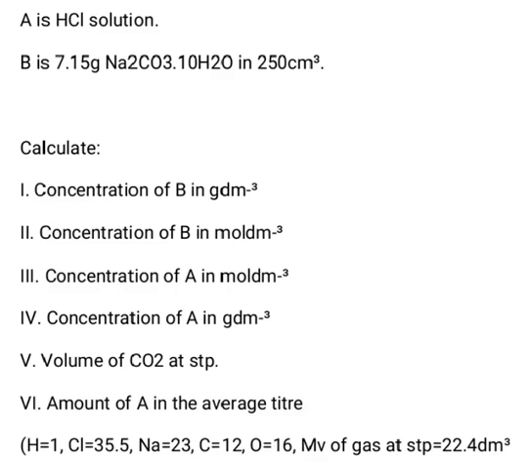Okay, you can see from my previous videos that we've done something similar to this along this line. Titration between hydrochloric acid and sodium trioxocarbonate(IV) decahydrate. I told you there are different modes, different patterns, in which questions can be asked. So this is another way.